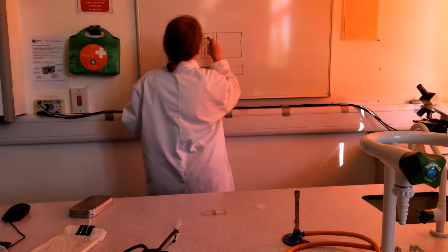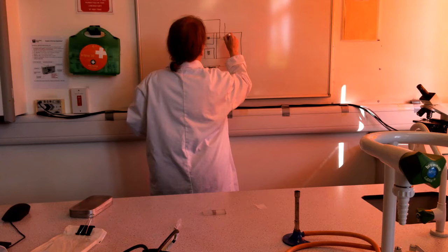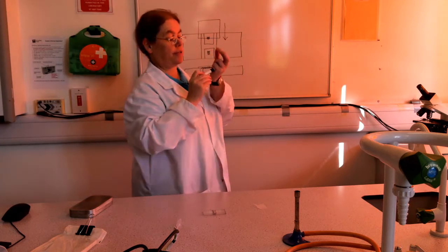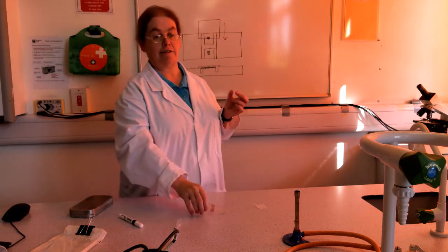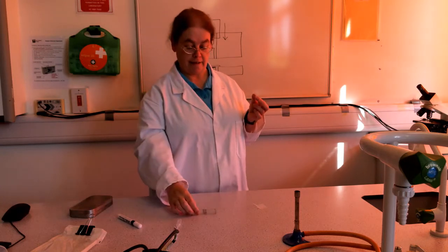sort of here, and you push that way. Push is the operative word. You have to press down really hard, which is why the slide is much thicker than a normal slide.